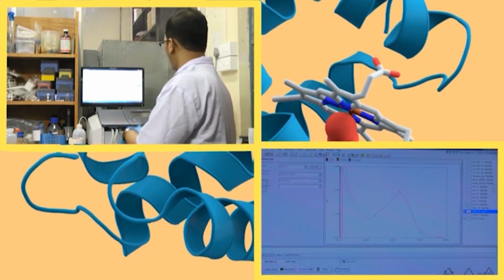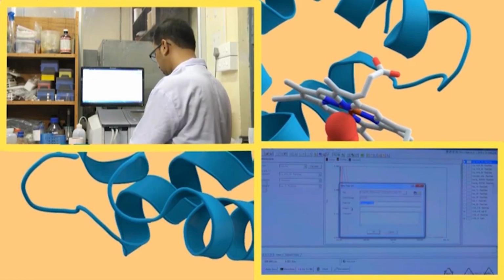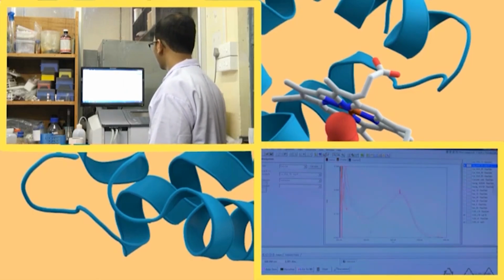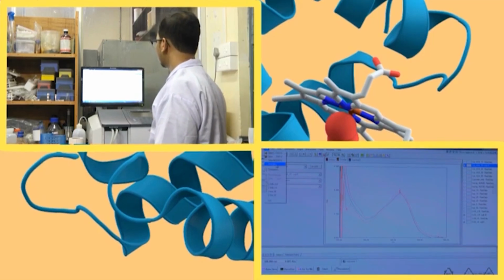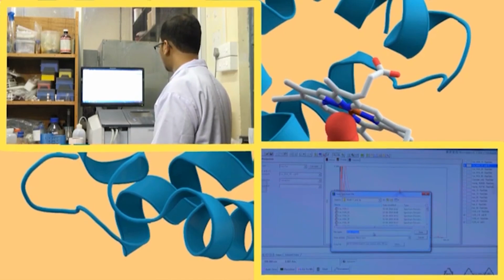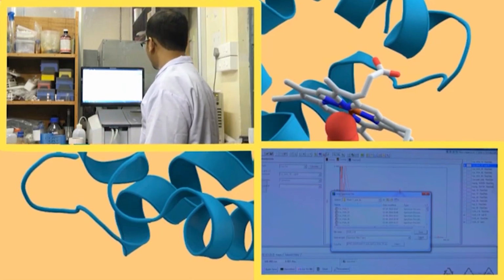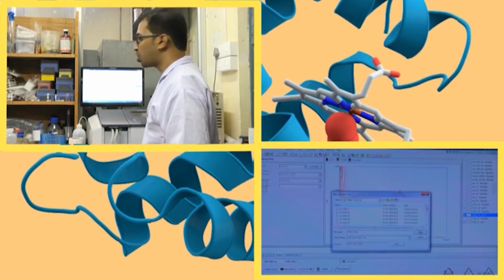And now we will shift to 15, curcumin HSA 15 minus HSA 15, which we call SUB 15. This one is for 15, and we will save it again as a sub file. In this way, similarly, we have to go on subtracting. Each and every time you subtract, please make sure to save these files.